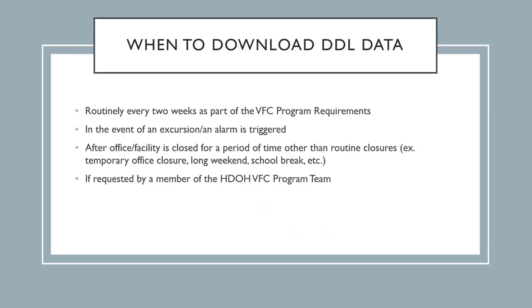There are a few times when it's necessary for you to be downloading your DDL data. For the most part, it should be routinely every 2 weeks, as this is a requirement of the VFC program. You would have to download your DDL data in the event of an excursion or an alarm being triggered. And you should download your data after the office or facility is closed for a period of time other than routine closures.